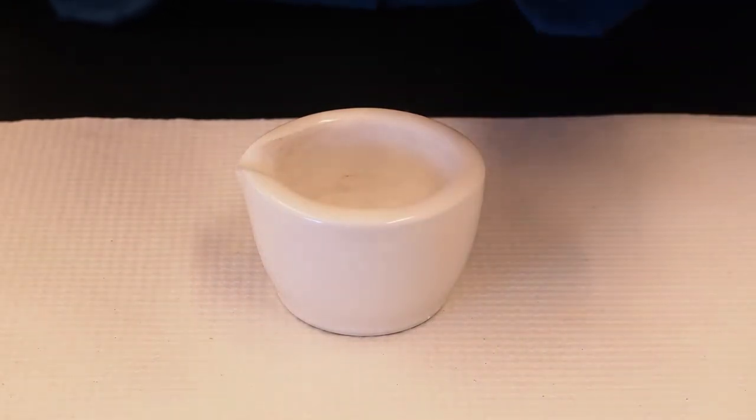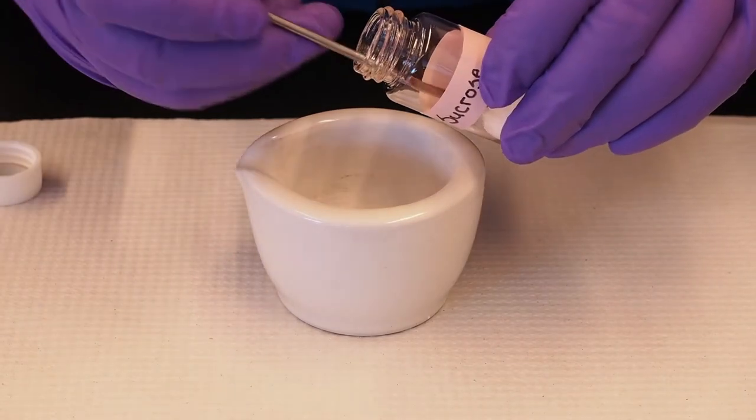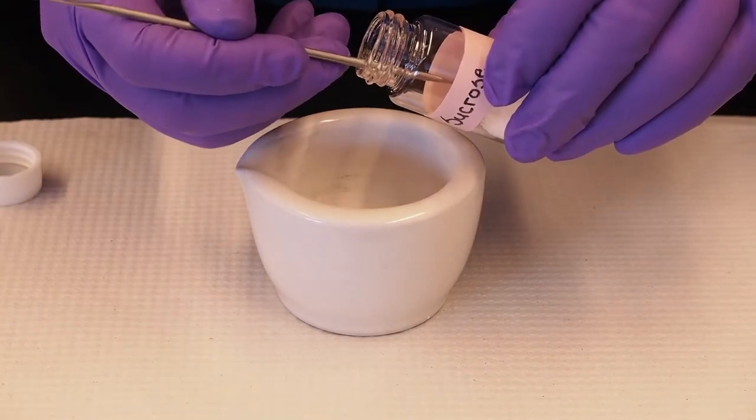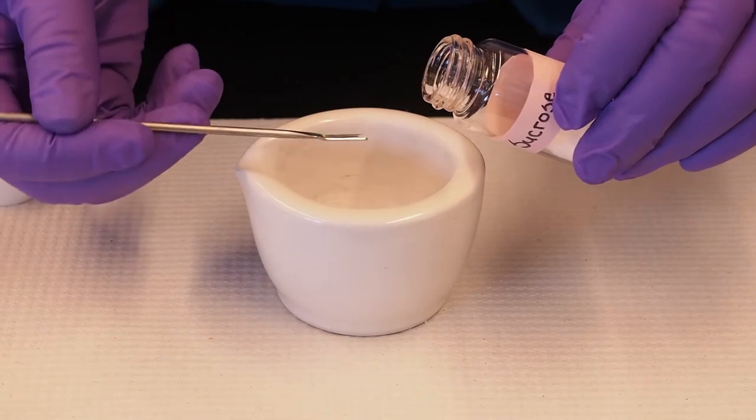Following this, use the small end of the spatula to add a small amount of your sample to the mortar. You should aim for a ratio of approximately 100 to 1 of KBR to sample.